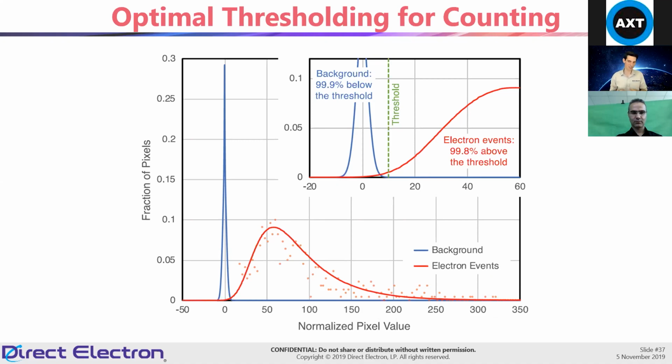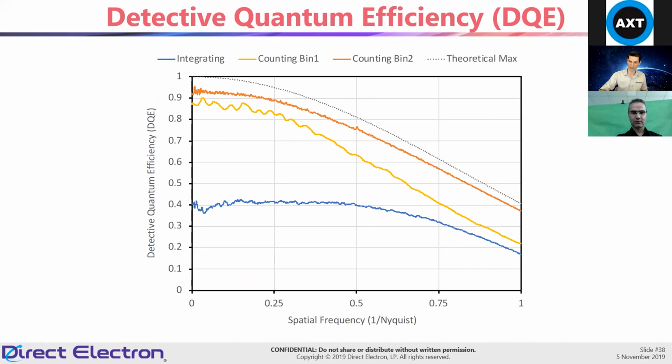So these are all about detectable events. And being able to have a really tight threshold allows you to get the maximum amount of signal out of the camera so that when you are counting, you really are finding all of these events. And this comes back to, if you have low noise, you have high accuracy counting, and you're doing this hardware binning to localize your events to single physical pixels.